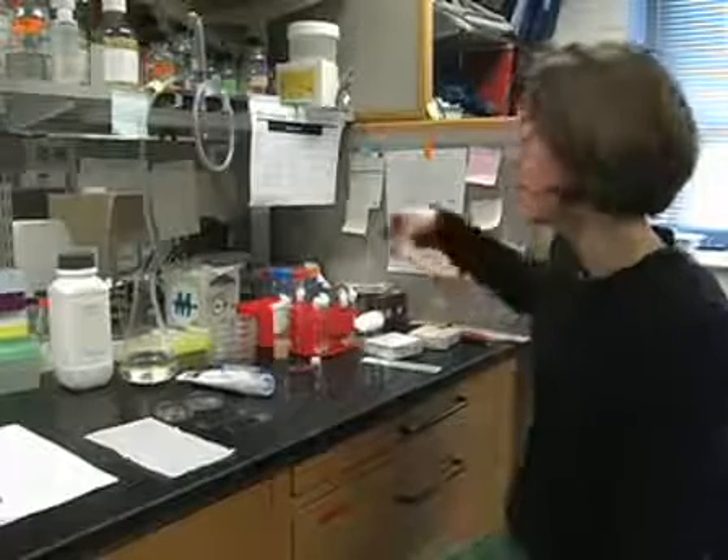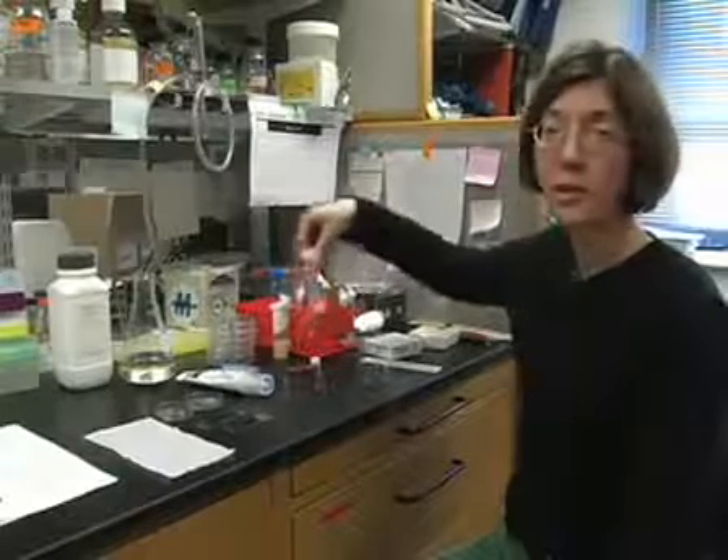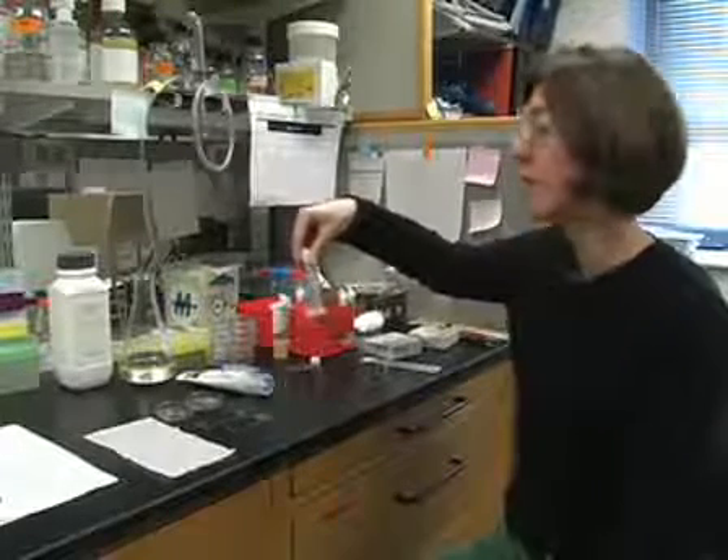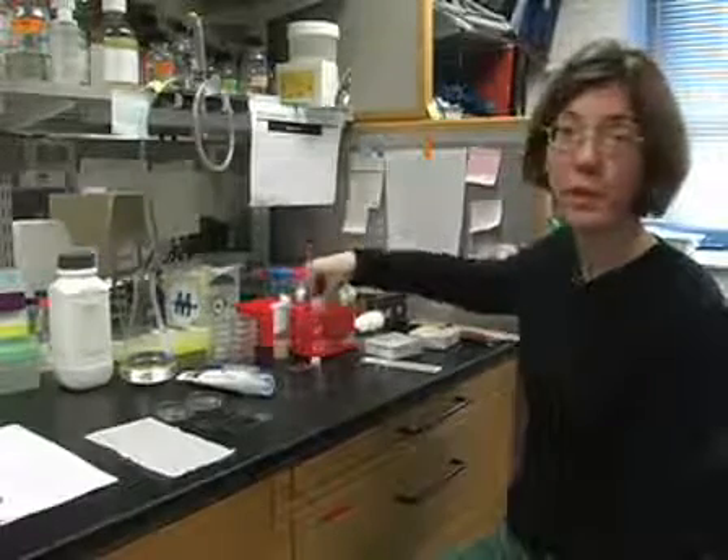The first thing we do is prepare isolation vials, which consist of microwaving fly food and adding 1.5 mils to a culture tube. When the food has solidified, we cap it with cotton.